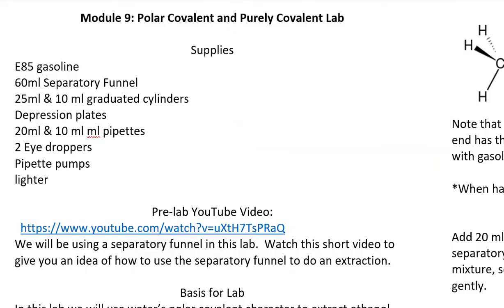Before you come to the lab, I want you to open the YouTube video that I have a link to here. This is a Flinn video that describes how to use a separatory funnel, and that'll help you when we go about it. I'm going to show you how we use our setup here, but watch that video as well.